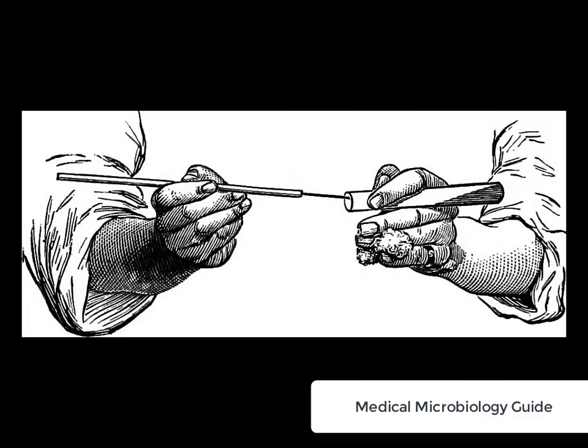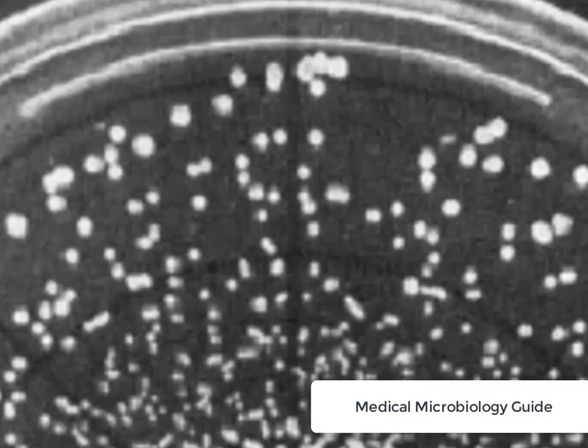The inoculating wire is used for stab inoculation of semi-solid or solid media. It is also used to pick a colony when two closely crowded microbial colonies are present on a solid medium.